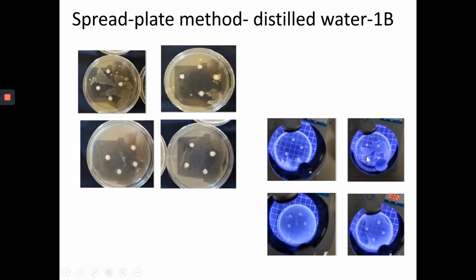For the next one, only one of them can be used. The bottom one is much better. You can see that there's a biofilm developed, so you can still measure the inhibition zone for this one. Again, for microbiology, you need to be mentally ready that sometimes the plate doesn't work as expected, and you need to do a few more trials.